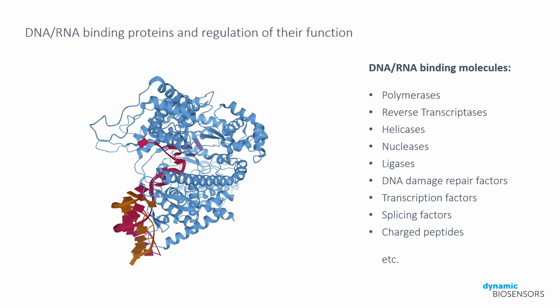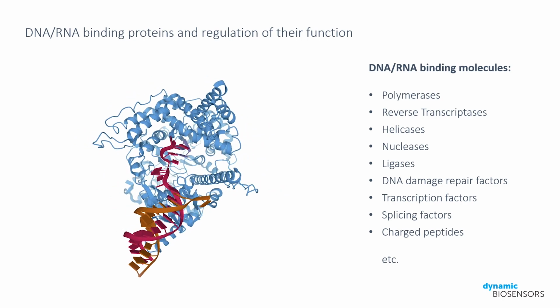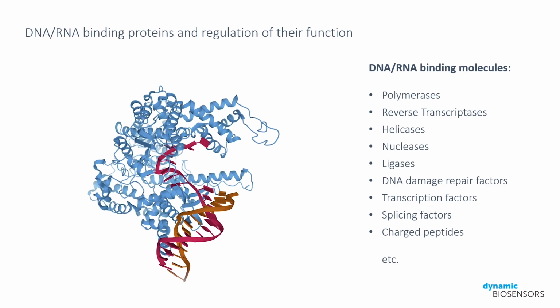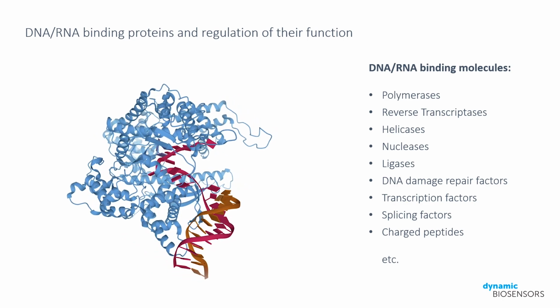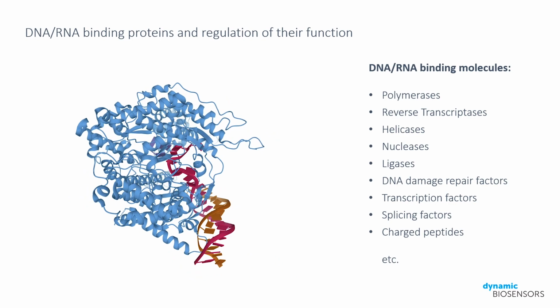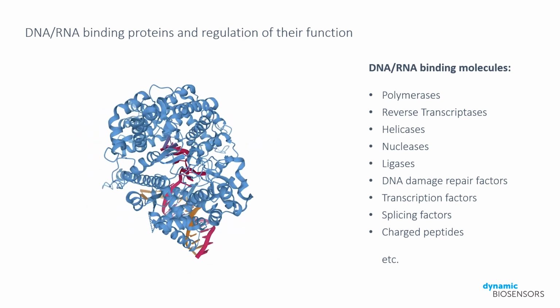The following tutorial measures the interaction between an RNA polymerase and its promoter DNA. RNA polymerases have received a lot of attention recently due to the COVID-19 pandemic, since the virus uses an RNA polymerase for replication. However, we will use here the simpler model of the bacteriophage T7 RNA polymerase.